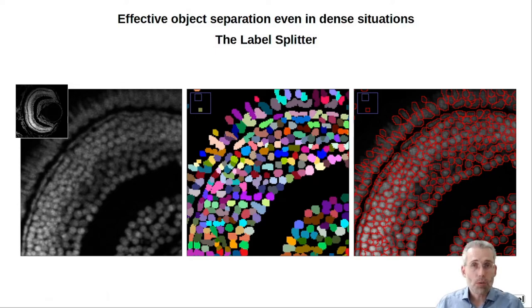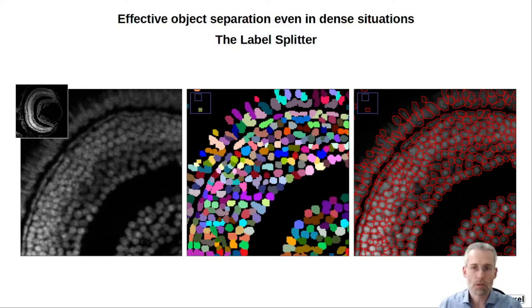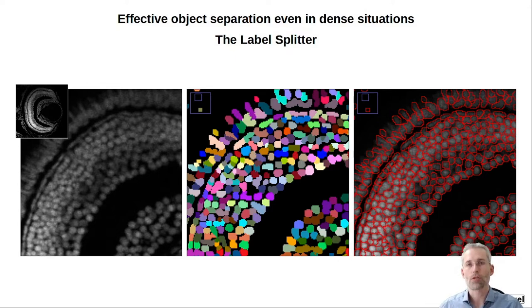It also performs extremely well in very dense environments. We see here that it can separate objects where standard methods like the watershed will have some difficult times. In some situations this label splitting is actually available in the toolbox as a separate tool and can be applied to already extracted binary objects, or is part of the Voronoi Threshold Labeler.